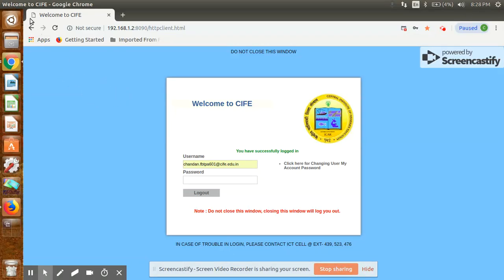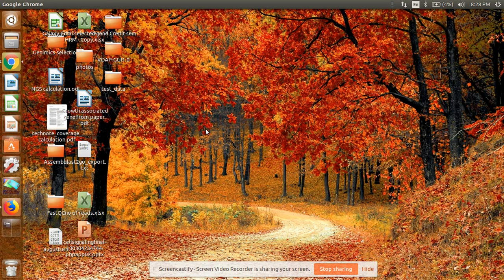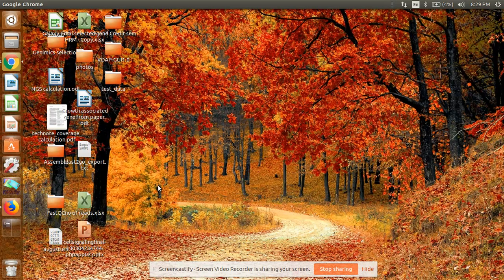Today I am going to discuss how to trim raw sequence data. After getting the sequence and checking quality, we need to trim out all unnecessary sequence. We can select two main parameters: one is quality score, also known as Phred score. We select a minimum Phred score above which we keep the sequence, and below that score we discard the sequence from our raw data. Generally we take a Phred score of 20.